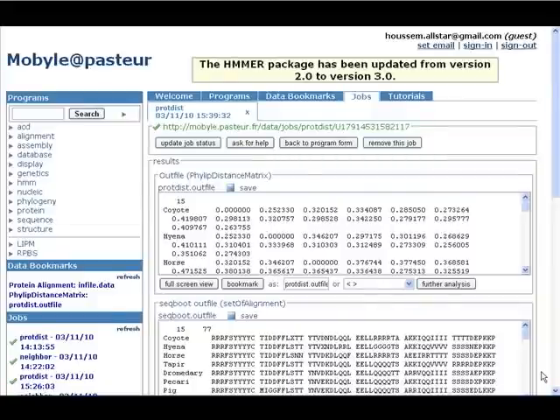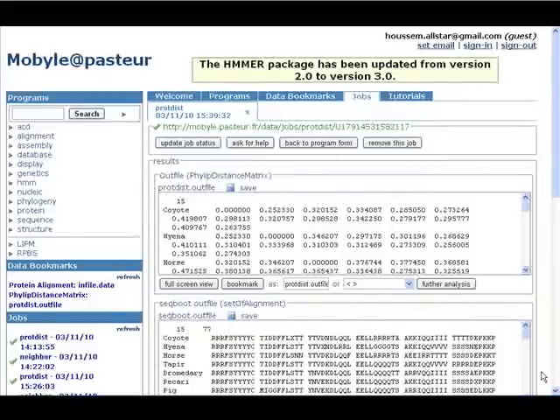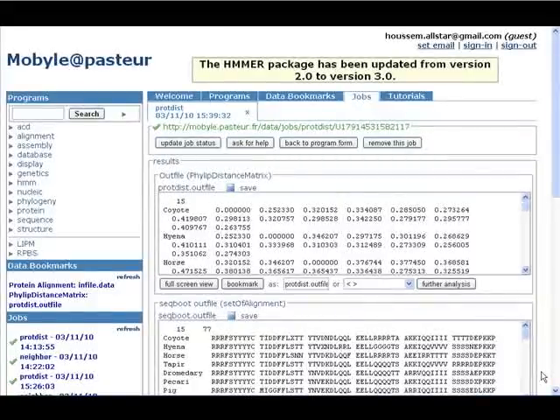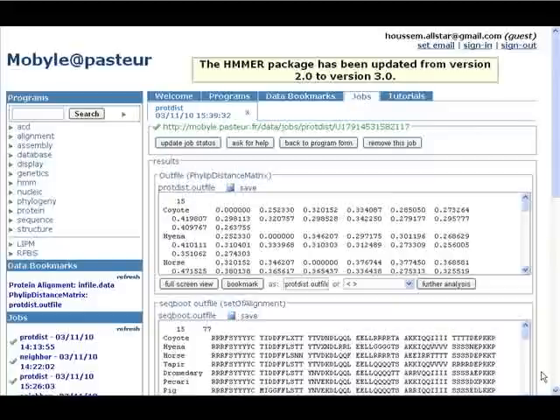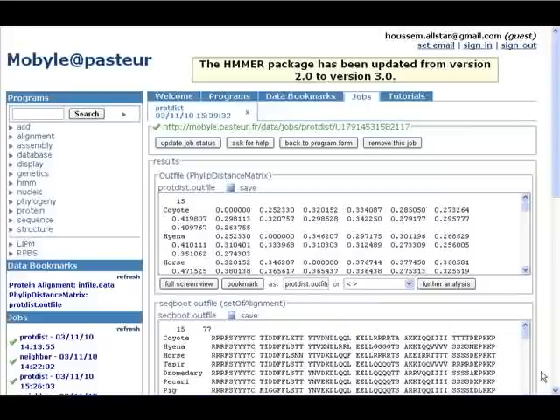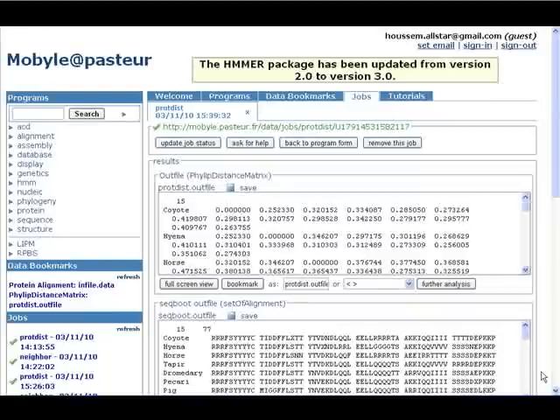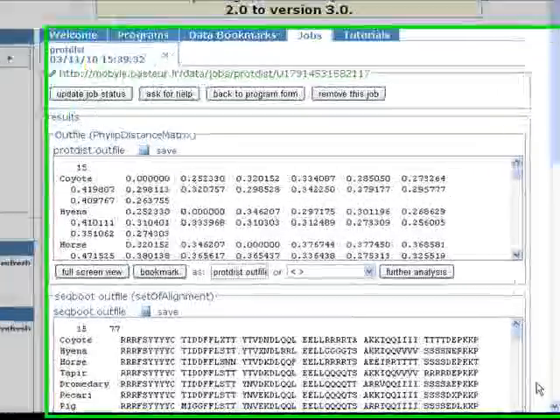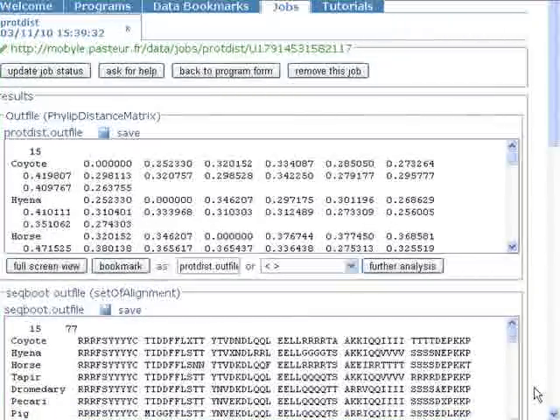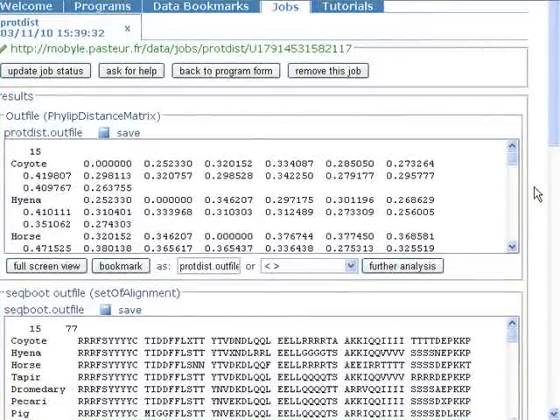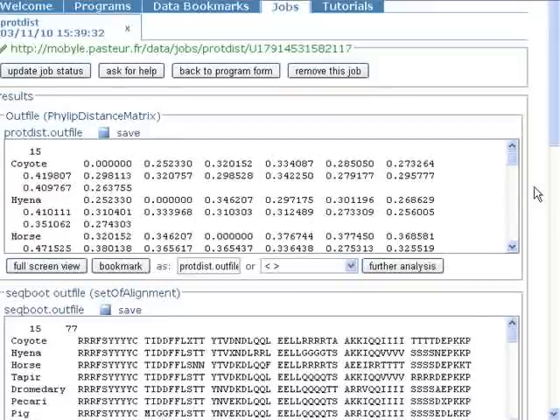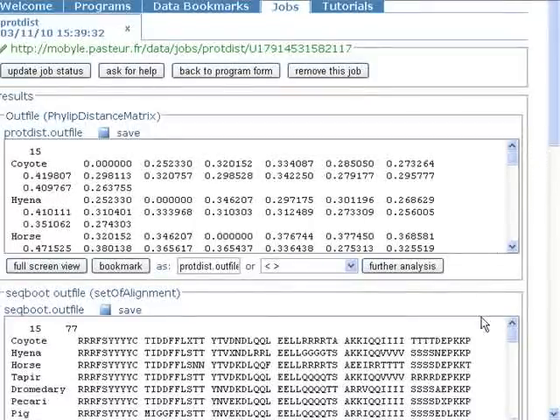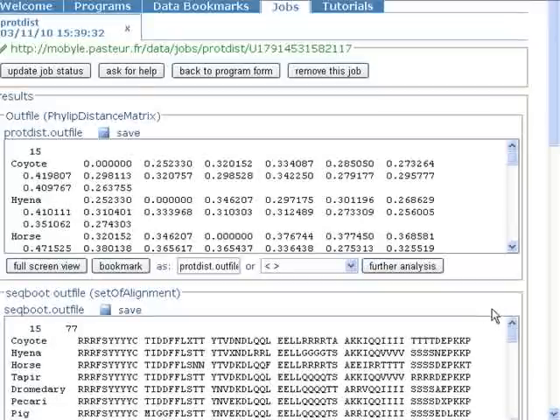Hello and welcome again to my bioinformatics tutorial series. This is the second video section for using the phylogeny inference package to construct or build phylogenetic trees. In the previous video we stopped here, so we'll continue today.